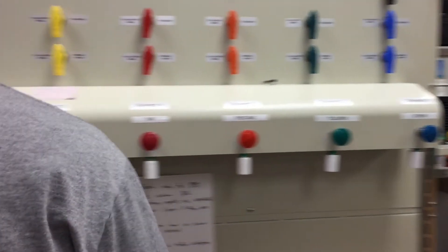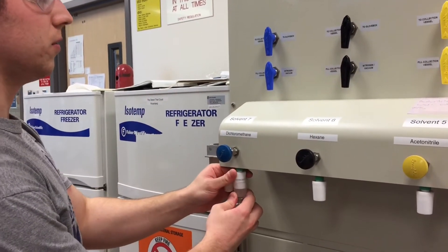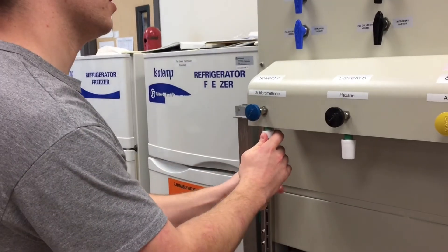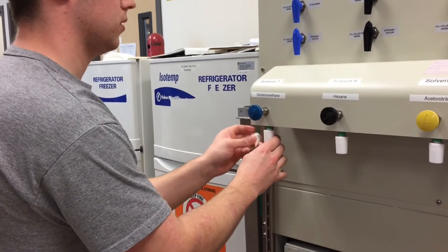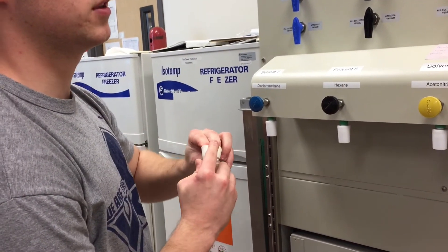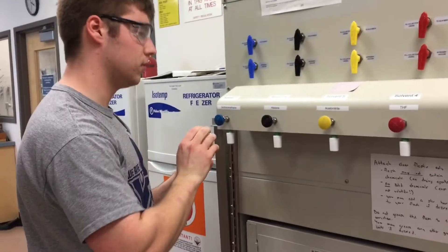I'm going to remove this first. You want to just pull it off — it is pretty challenging. You want to cap it as soon as you can to prevent oxygen from getting into the system, and then you can turn it off.